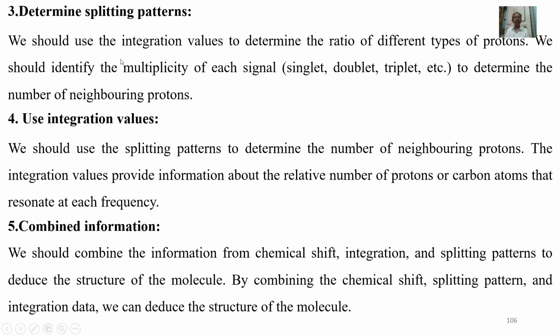We should use the integration values to determine the ratio of different types of protons. We should identify the multiplicity of each signal, singlet, doublet, triplet, and so on, to determine the number of neighboring protons. We should use the splitting patterns to determine the number of neighboring protons. The integration values provide information about the relative number of protons or carbon atoms that resonate at each frequency.